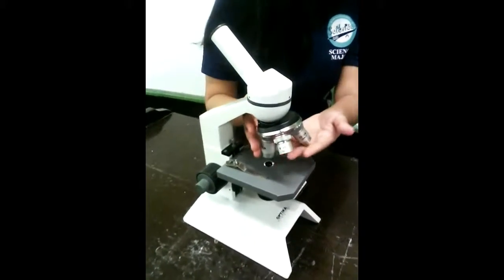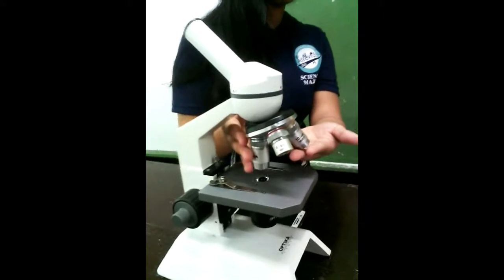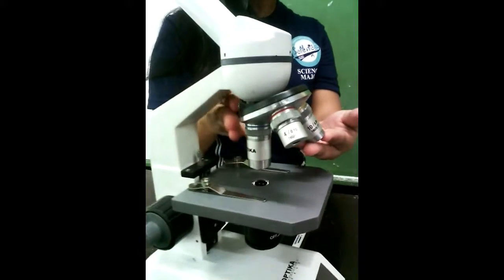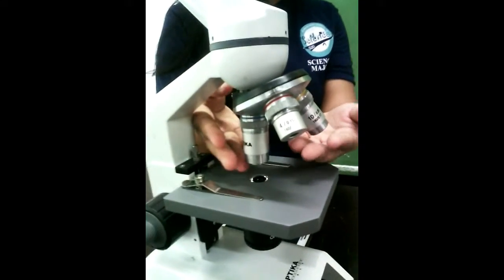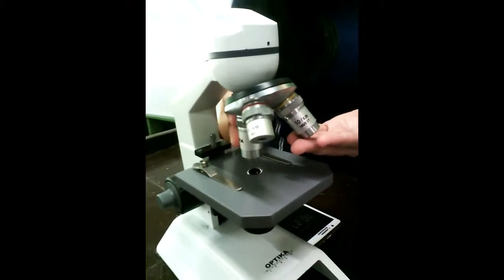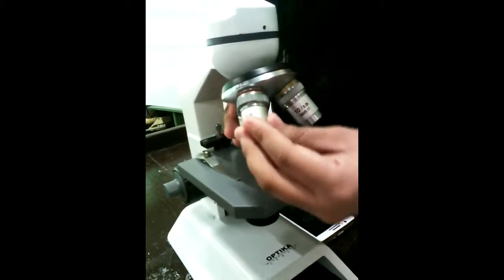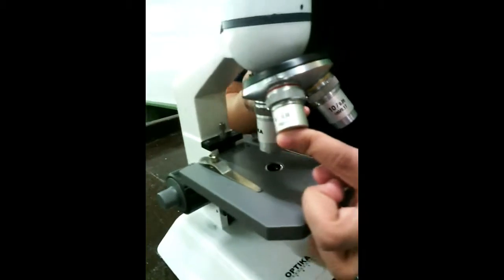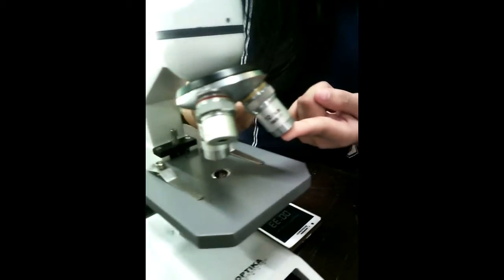The objectives. Usually an ordinary laboratory microscope has two or three objectives attached to the revolving nose piece. These are the scanner, the low power objectives, and the high power objectives.